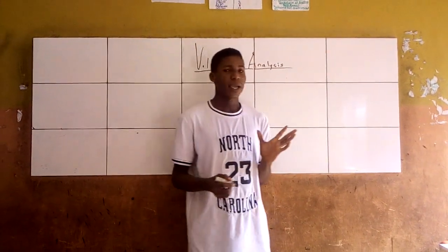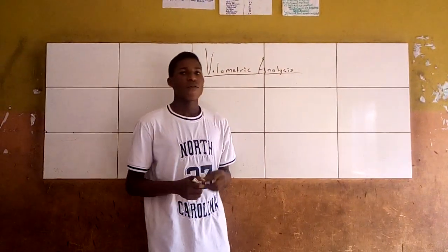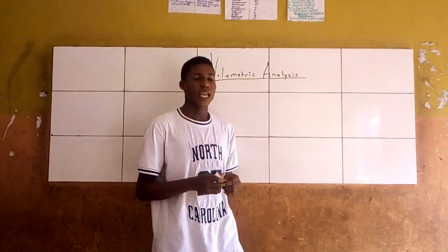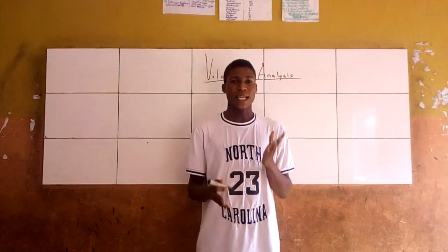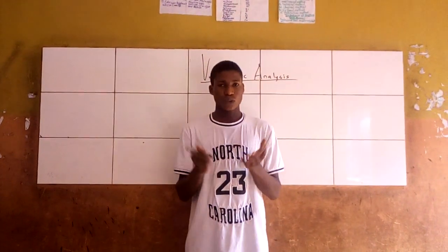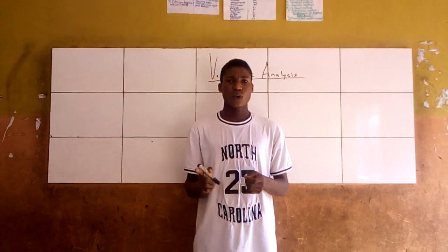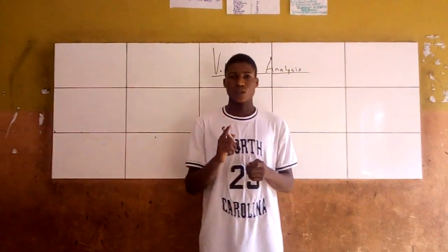So back to my topic, volumetric analysis. Volumetric analysis involves titration, and titration involves a reaction between an acid and a base, which is called neutralization. So any process whereby an acid reacts with a base to form a salt and water is called neutralization.